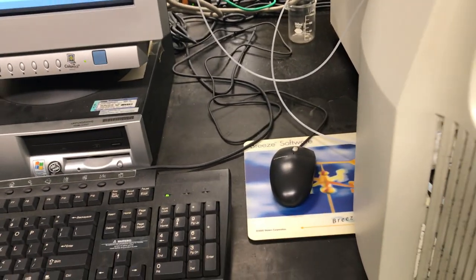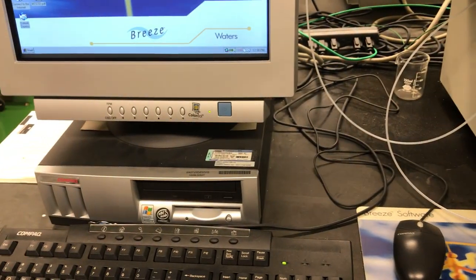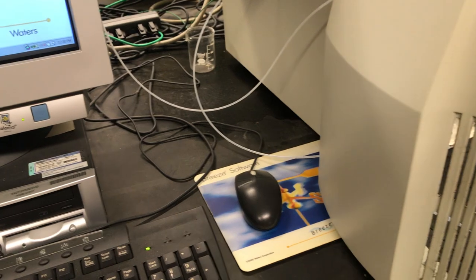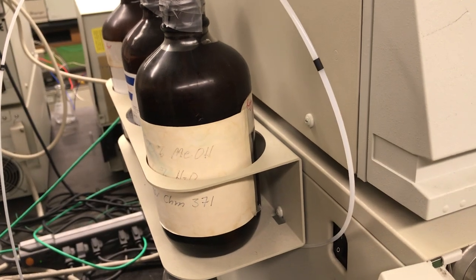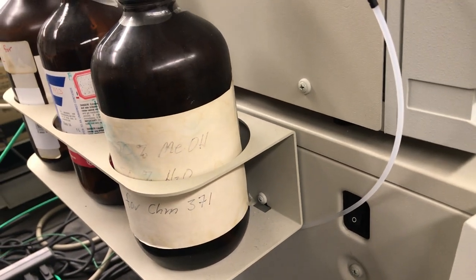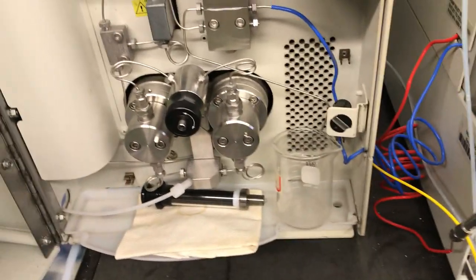High-performance liquid chromatography, or HPLC, is a separation technique for samples in complex mixtures in the liquid phase. We're going to start with what we call the mobile phase — the liquid carrier that pushes our sample through the instrument. In this case, the mobile phase is a simple 50% by-volume mixture of methyl alcohol and water. We have a sipper or tube that leads from the mobile phase reservoir down to a pumping system.